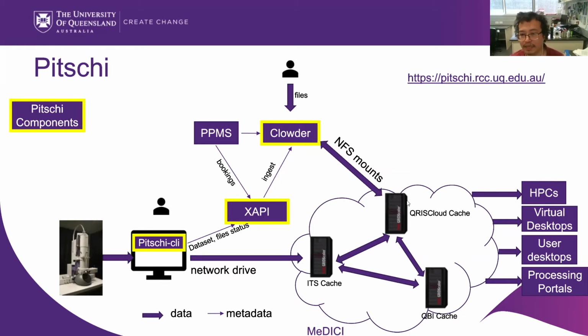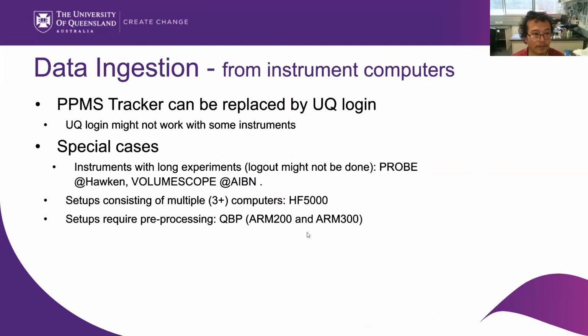And once the data is in the data fabric, it can then be accessible from HPCs, virtual desktops, real desktops, or other portals. Okay, so with the second option, the direct ingestion from the instrument computer, the PPMS tracker can be replaced just by UQ login. The problem with that is it wouldn't work for some cases where the instruments require a certain program to be on all the time, because it involves recalibration of the instruments if the program is shut down and opened again.